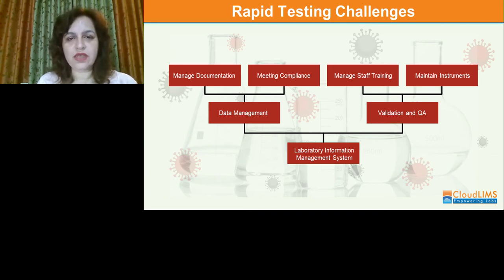One of the reasons, of course, is that not enough labs are equipped with testing of such contagious specimens. And those which are, they are facing numerous challenges. In these times, recruiting staff experienced in handling infectious specimens is a challenge. If experienced staff is not available, training needs to be scheduled. So following SOPs and safety practices in handling infectious samples and testing is of paramount importance. Testing kits are already limited, and any mistakes will lead to a wastage in time and energy and would have consequences for both the patient and their families.